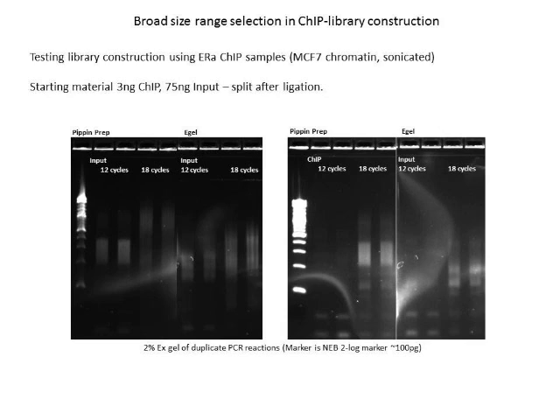You can see that I collected 3 independent samples, 3 times over while the eGel was running. So that's why you see 3 distinct bands there. That was expected. And on the right-hand side, we had ChIP. I've driven it all the way out to 18 cycles. And again, you can see from the Pippin prep at 18 cycles, you have a fairly clear band.